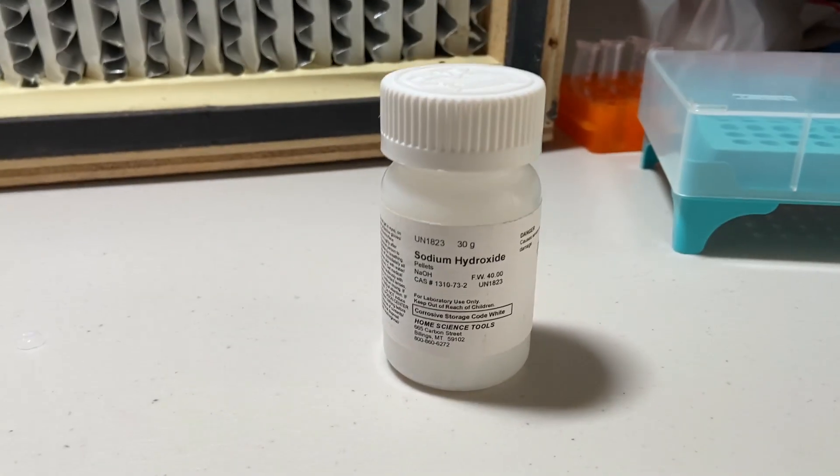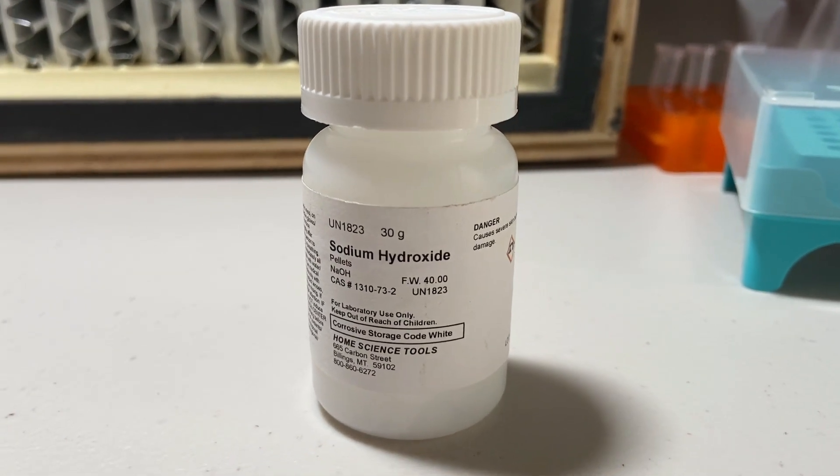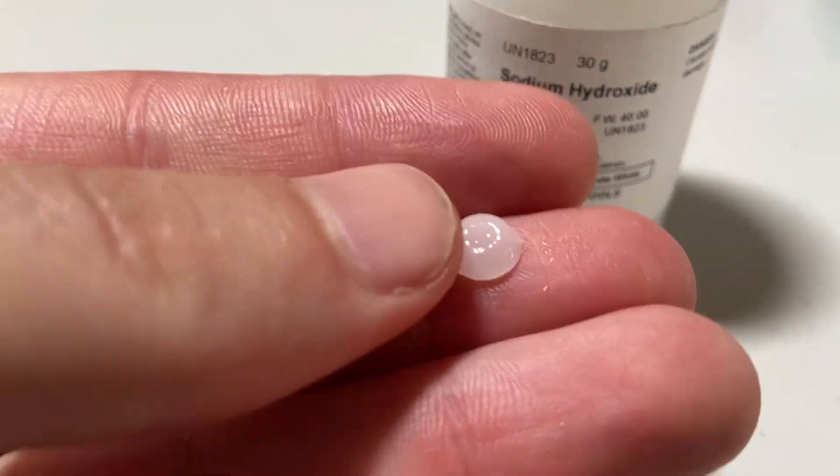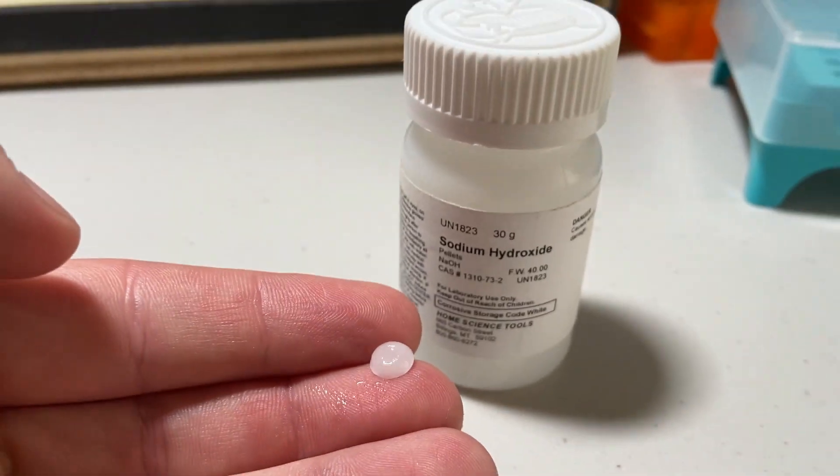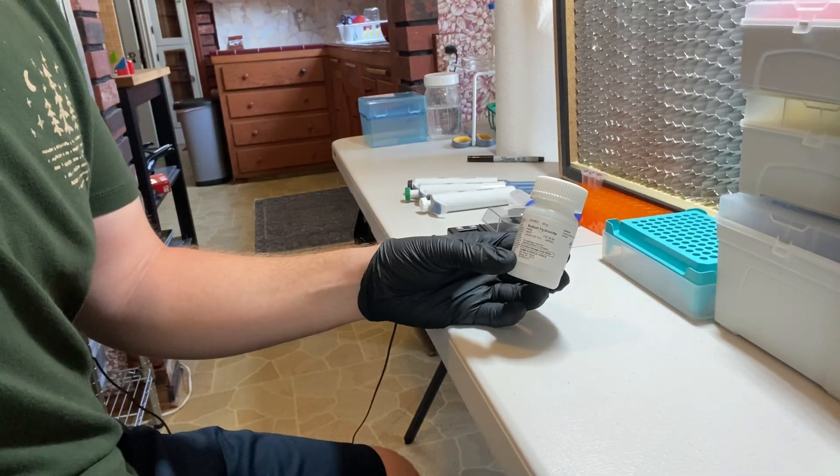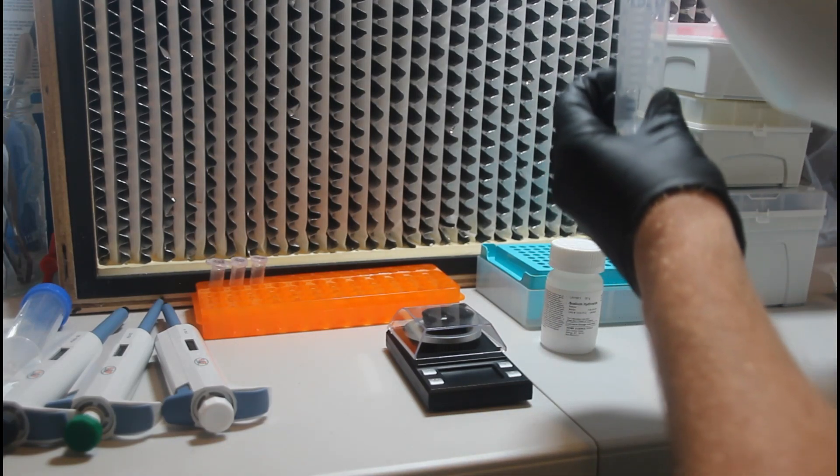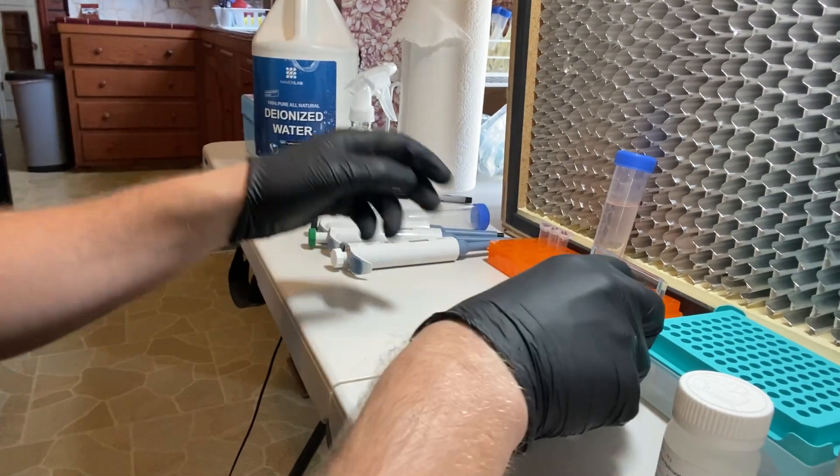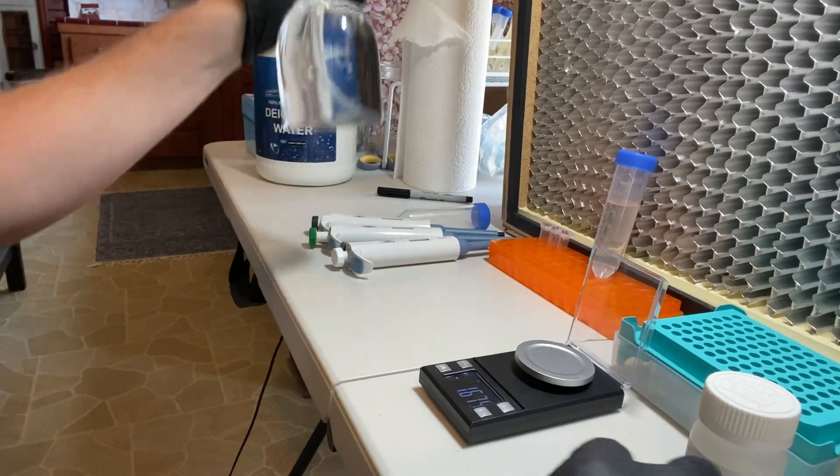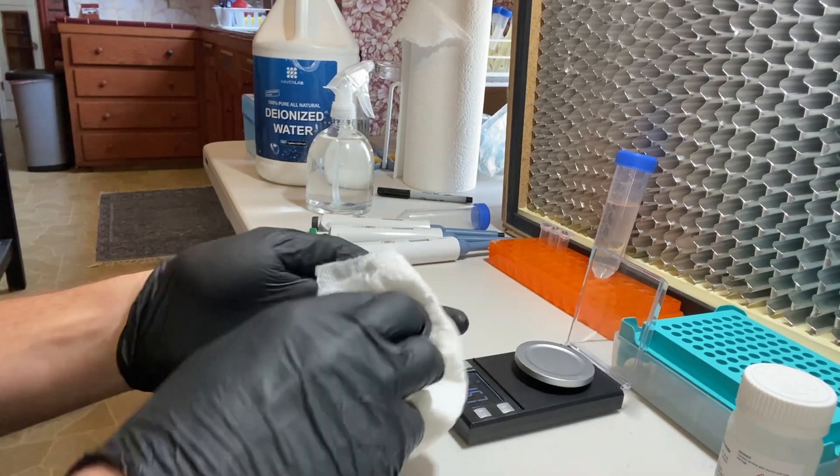The first step in the DNA extraction process is to prepare a working solution of sodium hydroxide. To prepare a working stock solution of 0.5 molar sodium hydroxide, we're going to take approximately 30 milliliters of distilled or deionized water, weigh out 0.6 grams of the sodium hydroxide, and mix it into the water.